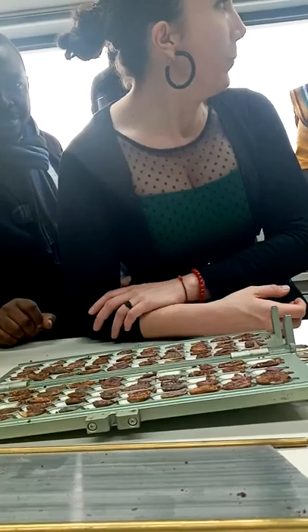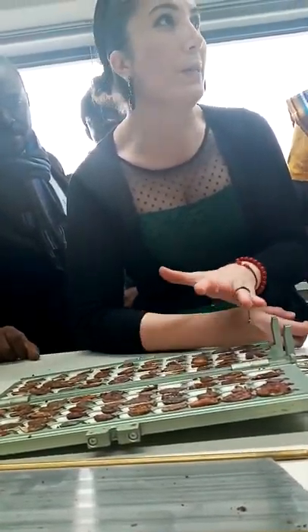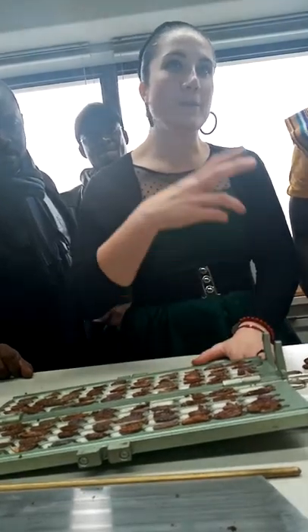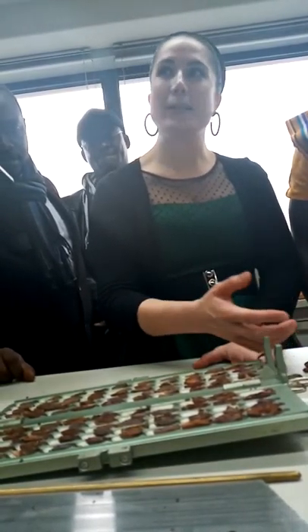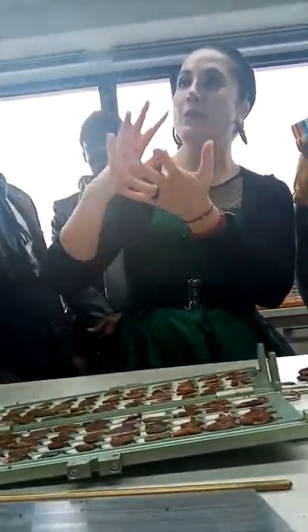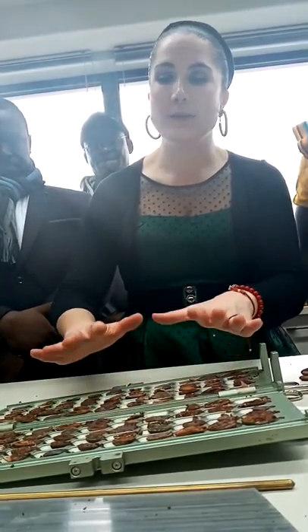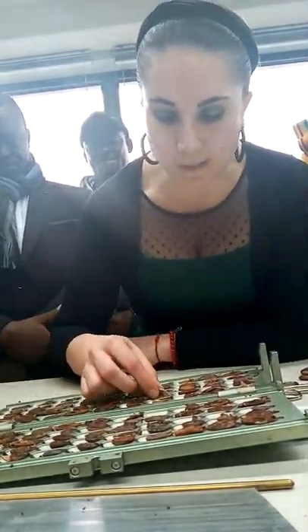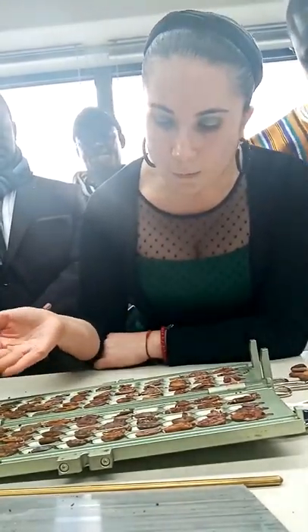It's four percent. Once you do the 50 beans cutting test, you multiply the findings by two, because you either perform two cutting tests for 50 beans or you base your findings on this one cutting test. So in this case it will be four percent.